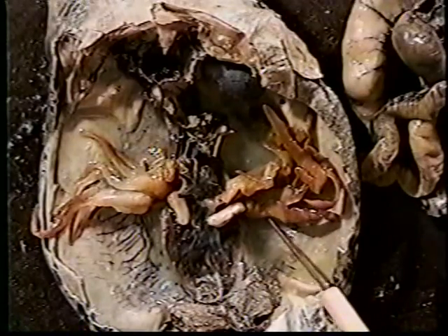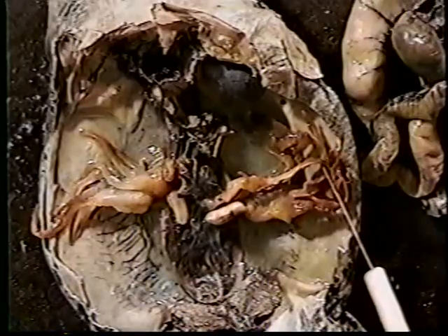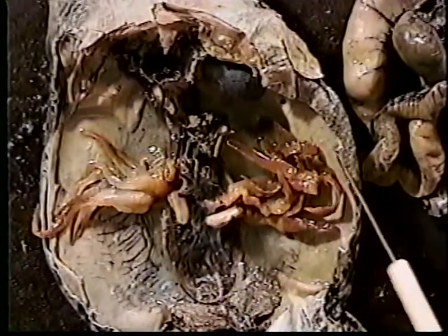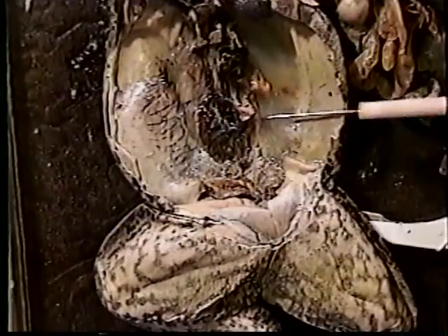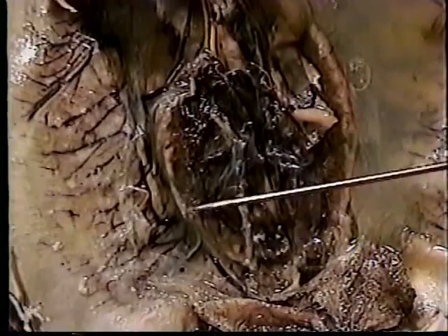If we were to remove, like we shortly will, the testes and the fat bodies, we'll get a closer look at the kidneys. In clear vision are now the kidneys.